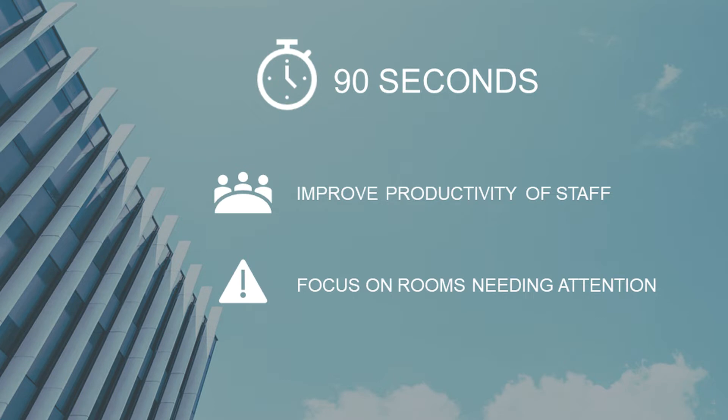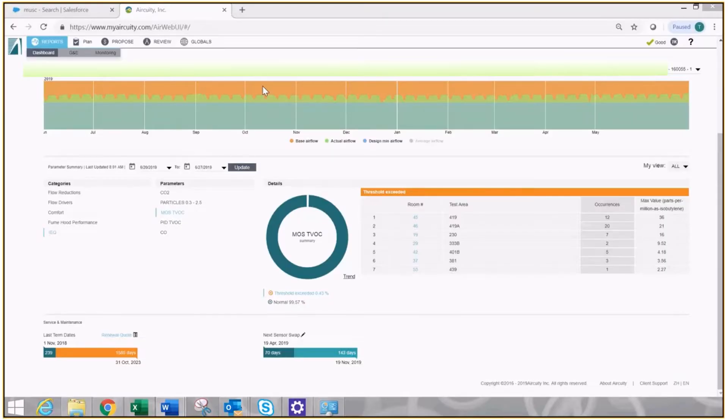90 seconds. I suggest you can use this technology to greatly improve the productivity of your staff and to focus on the worst problem rooms. Here's how. Start your stopwatch right now. Log into MyAirCuity.com. You'll immediately come to this screen.